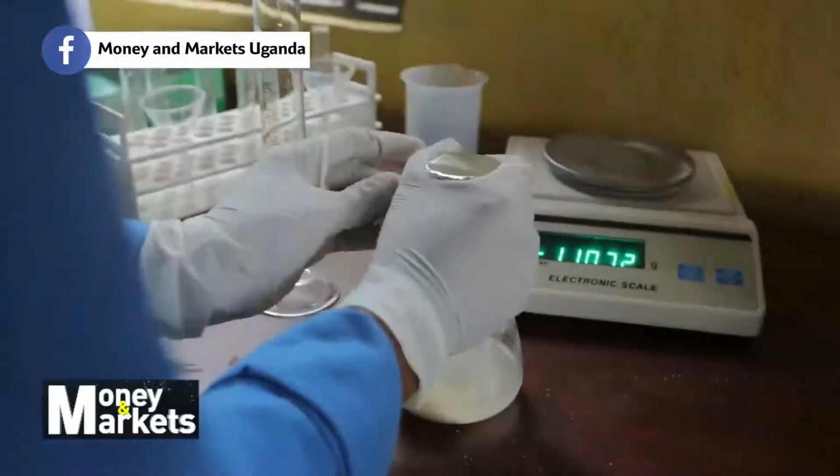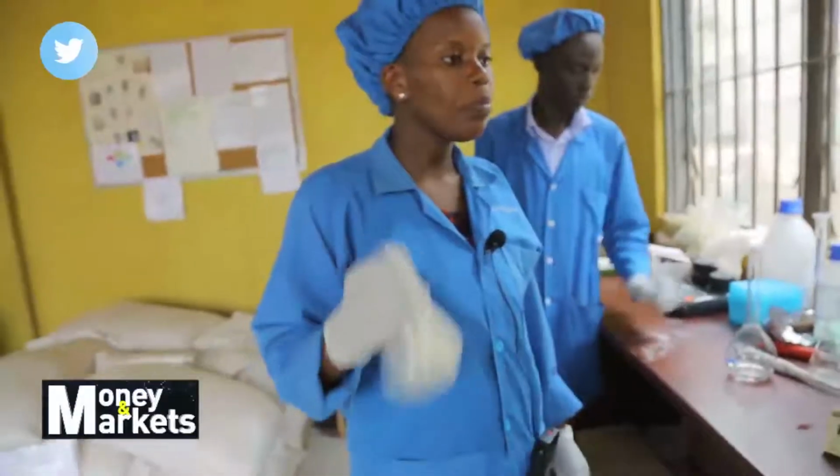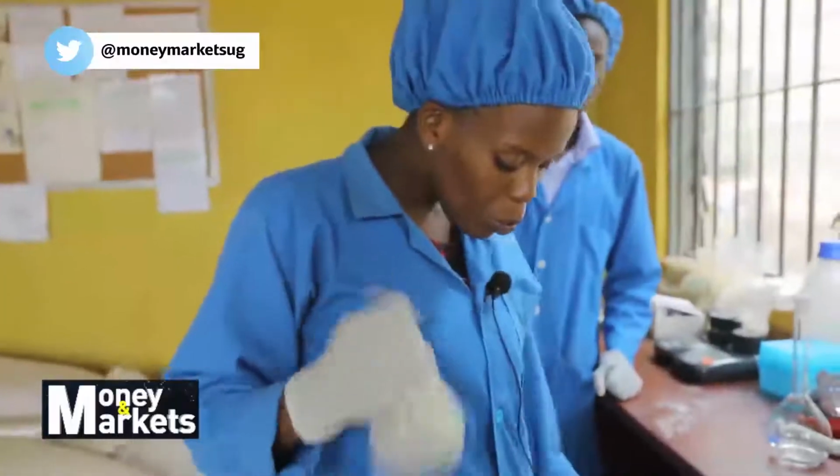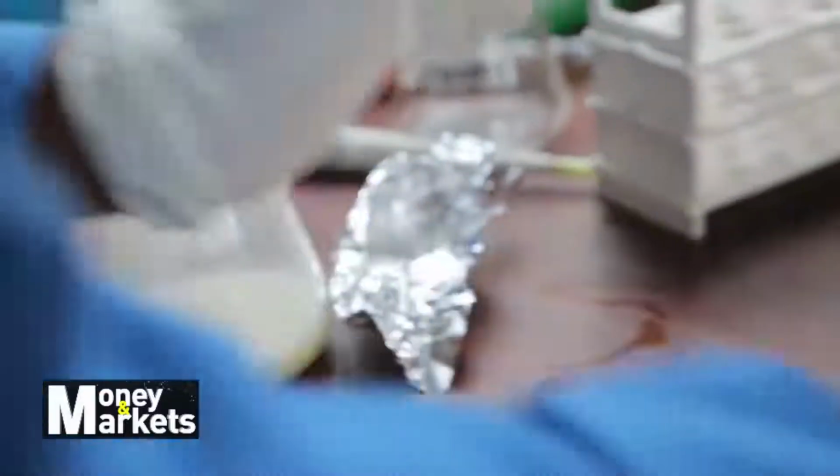So after you cover it very well, make sure that it doesn't fall, because we are going to shake for 3 minutes. After your 3 minutes, then you filter the sample.